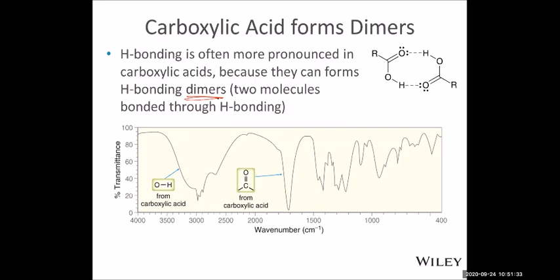So these are the two examples we have. This is acetic acid dissolved in carbon tetrachloride solution. The second example is acetic acid in the gas state. You can see the big difference, especially in the OH bond. The OH bond in the solution becomes a much stronger and wider absorption. Because hydrogen bonding between molecules becomes more frequent, it becomes much stronger. The carbon-hydrogen bond, which should be slightly less than 3000, has pretty much been buried by the wide OH band. You can barely see it.